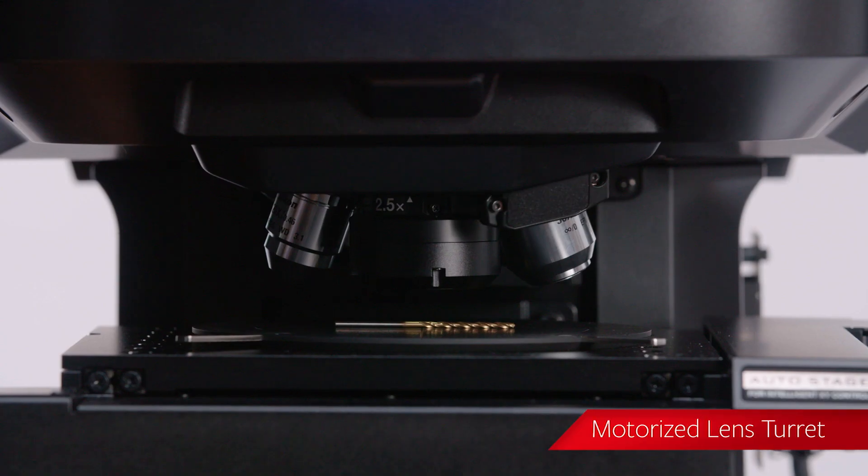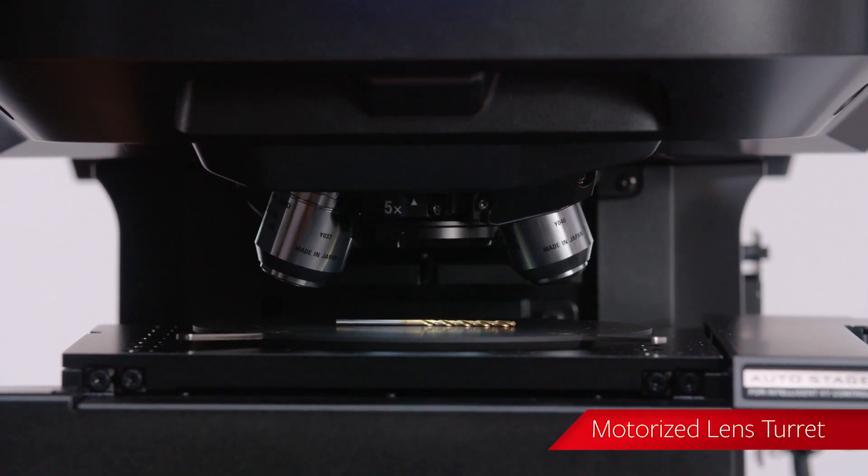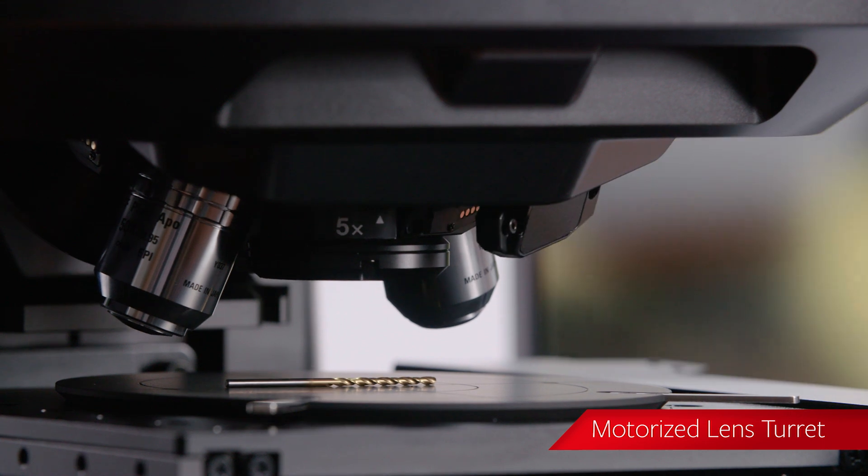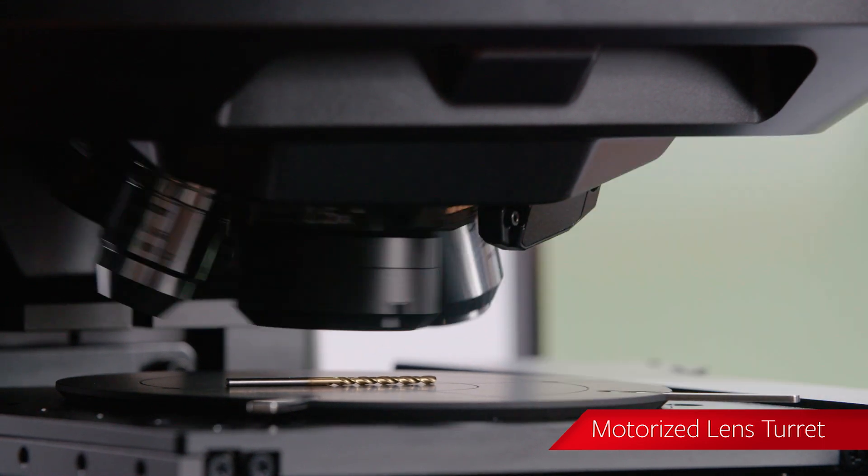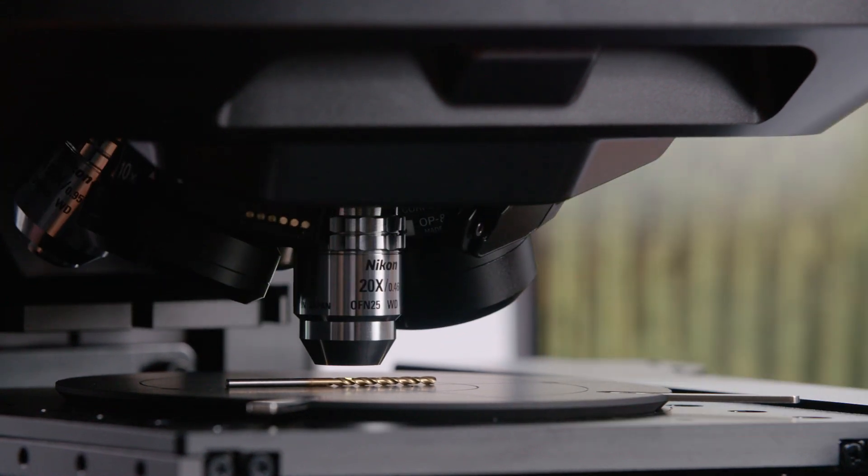Additionally, a motorized lens turret can hold up to six dedicated measurement lenses so that users can adjust magnification with a click of a button.